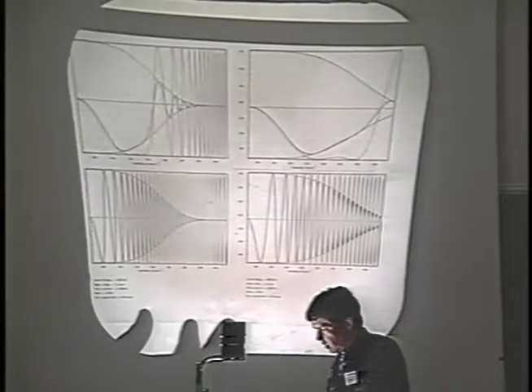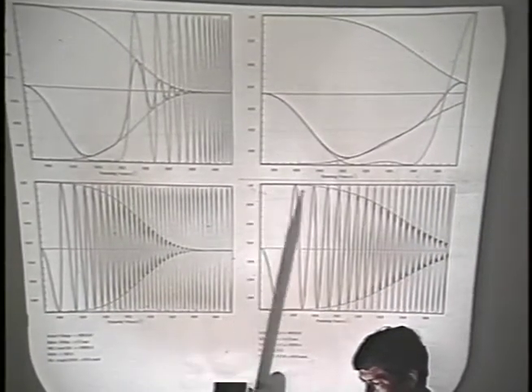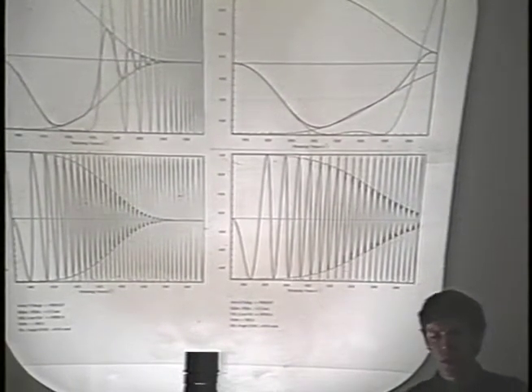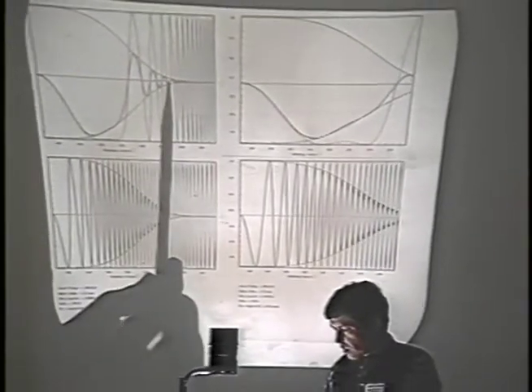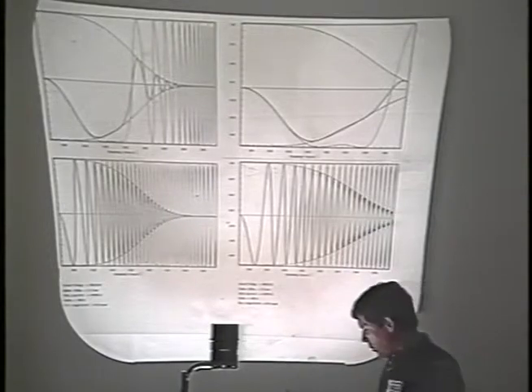That's reflected in these curves also. These envelope curves here are essentially the product of the coherence envelope functions, both for spatial coherence and temporal coherence. And you can see that indeed the envelope functions go to higher resolution before they fall close to 0. So this is probably one of the most direct influences of going to high voltage on the resolution.